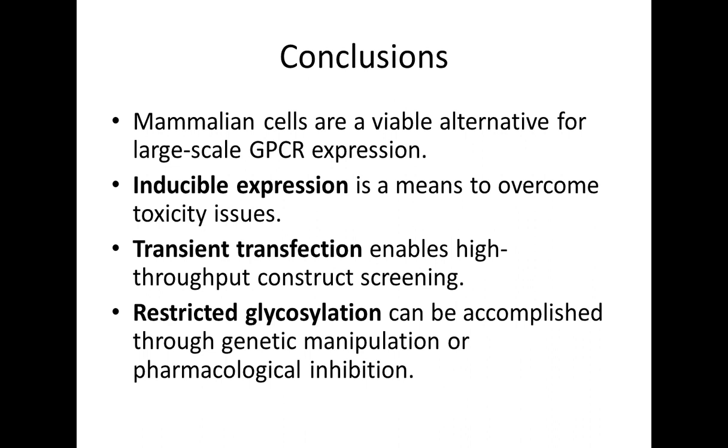Okay, how about screening in HEK cells and scaling up in Sf9 cells? Well, in some cases, this might be effective, but as Dean showed you earlier in the presentation, a lot of times we see major differences in the functionality of the protein going from HEK cells to insect cells, such as basically the affinity of the receptor to bind a ligand.